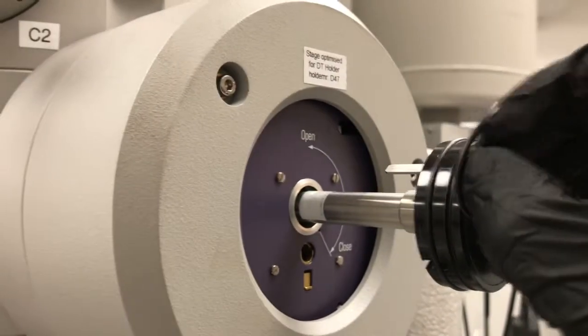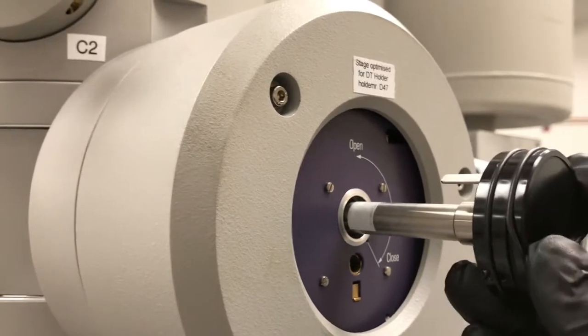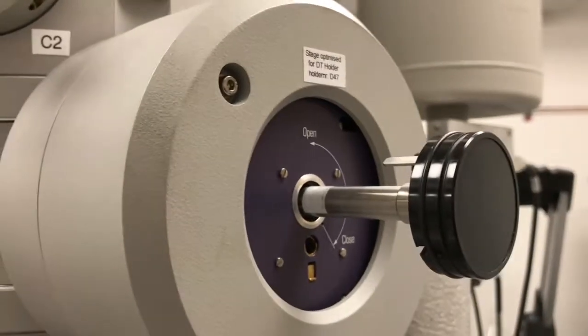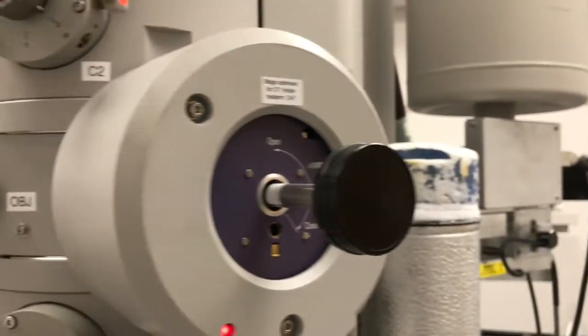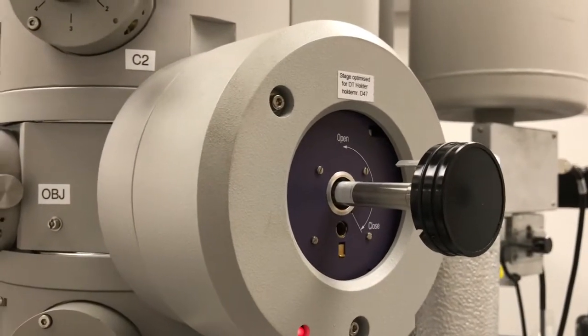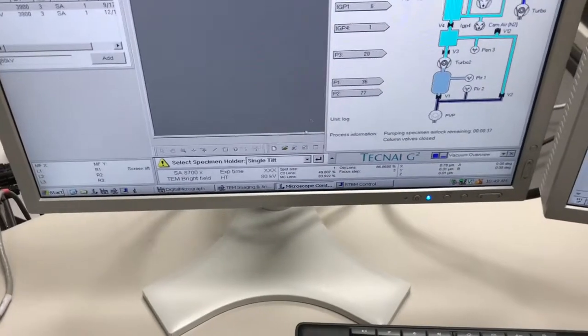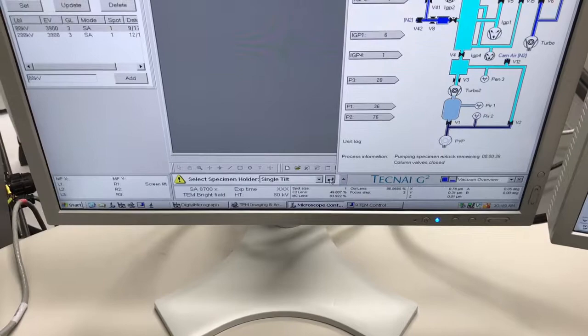It looks like one of these plastic rings came off here. I'll wait until the holder is inserted before I put that back on. That's obviously really just a more of a cosmetic thing, although it provides a little bit of grip. You can tell the system here we've got single tilt.